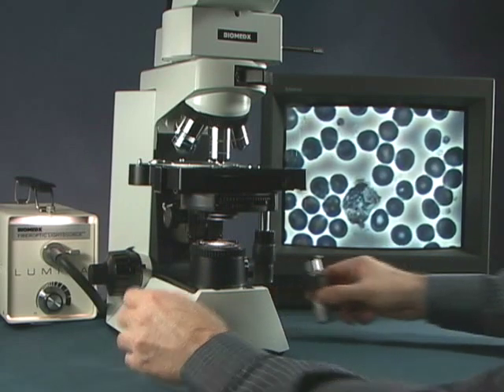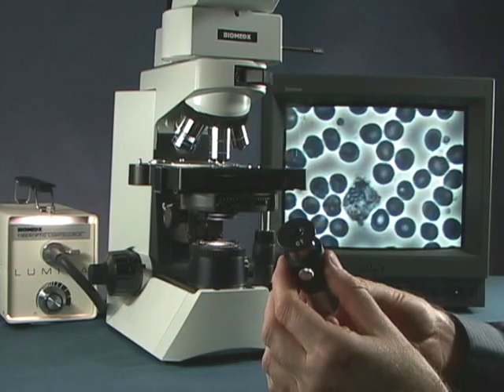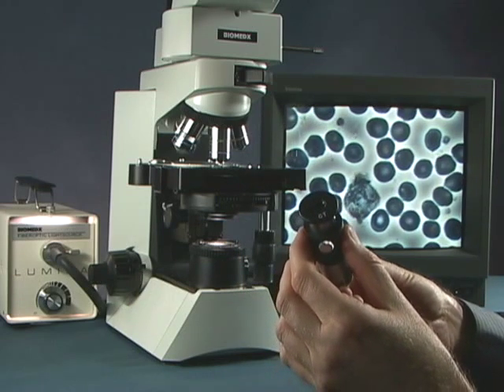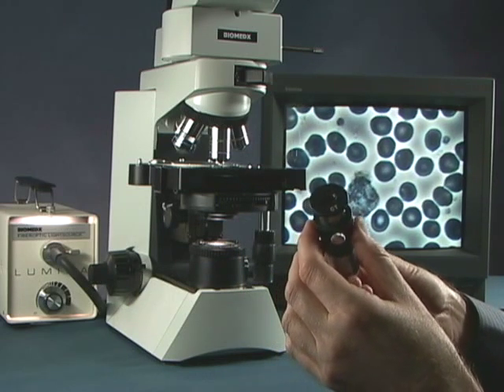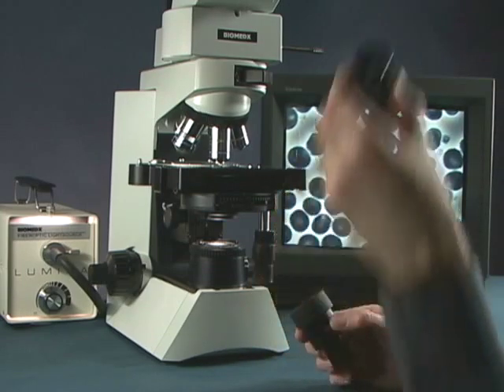Now we typically would use a centering telescope. This is a lens assembly that basically fits into one of the eyepiece slots. So we pull out the eyepiece and we simply put this in its place.